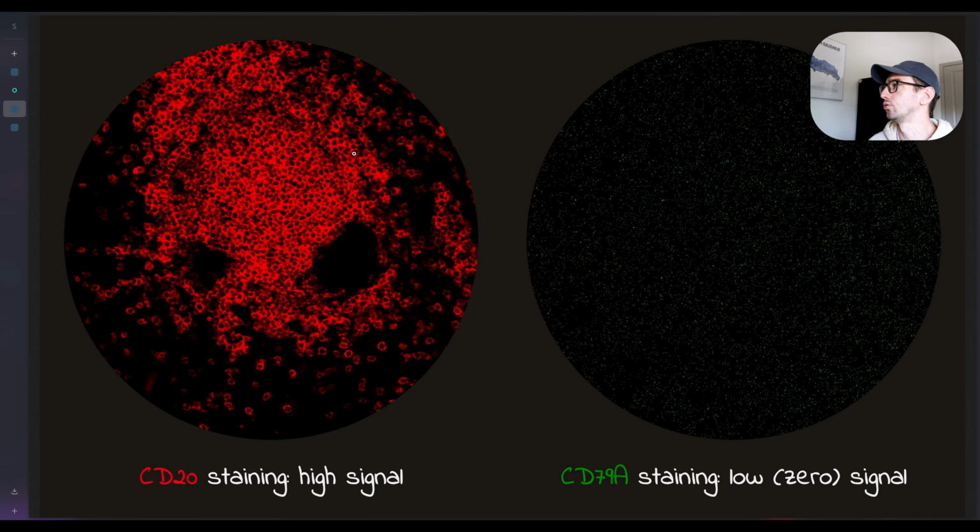So guys, I need help. Who knows what CD20 is? Is there anyone? A marker for which type of cells, if you know? Something with the immune system. Yeah, immune system. And if to be more accurate? Macrophage. Almost. B cells. So it's a B cell marker on the left.